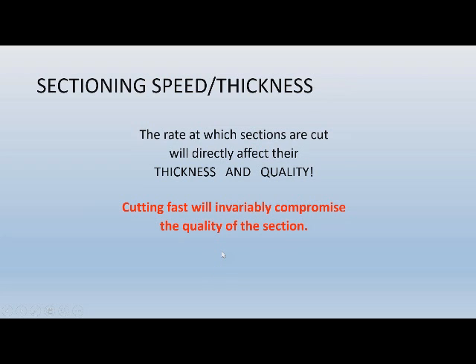Cutting fast will invariably compromise the quality of the section. Okay, so if you're in a spot right now where you're not embarrassed, if you can take your right hand that you would turn the thin adjust or the thin advance wheel and cut real fast. If you think about it, you will actually feel that you are adding more pressure as your hand goes down. And I'm doing it now, and I'm feeling it.